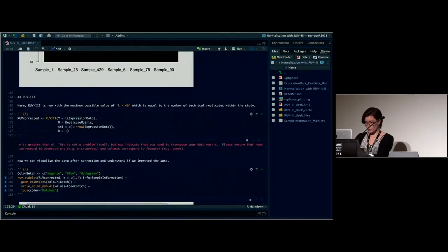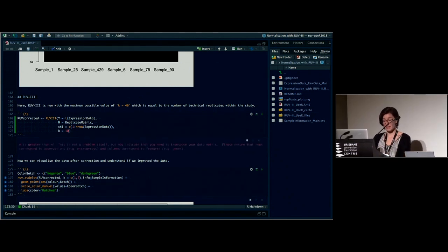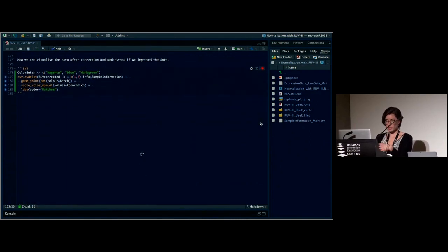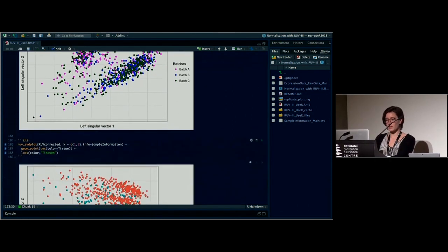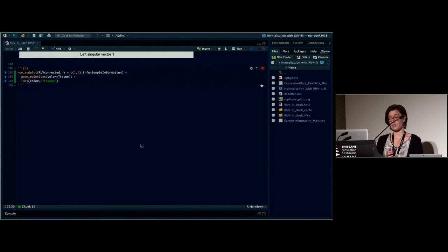And for example, if we go to 10, you should probably also try with a different set of negative control genes and see how it looks. If I go to 10, you see how it is also pretty easy. Probably from 10, you already see that you did a good job.